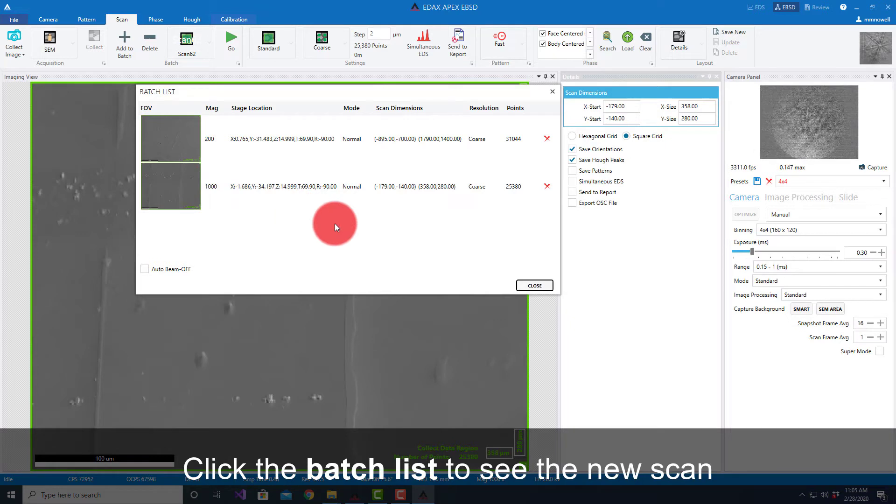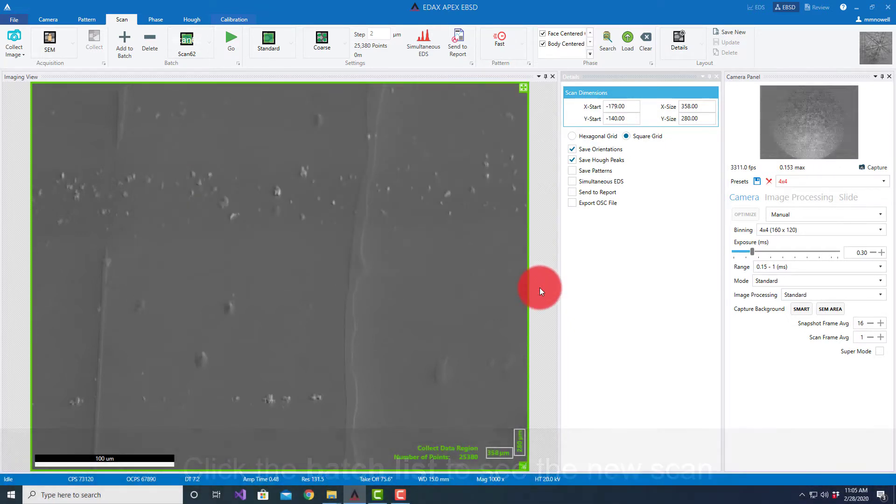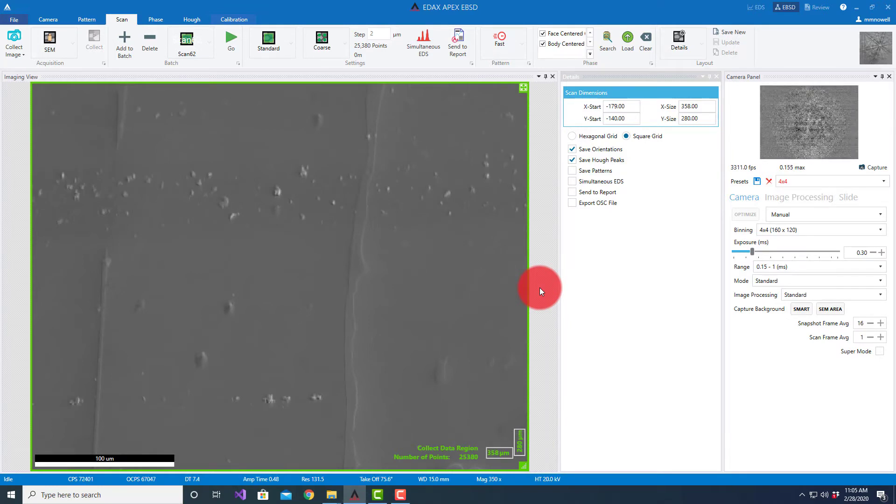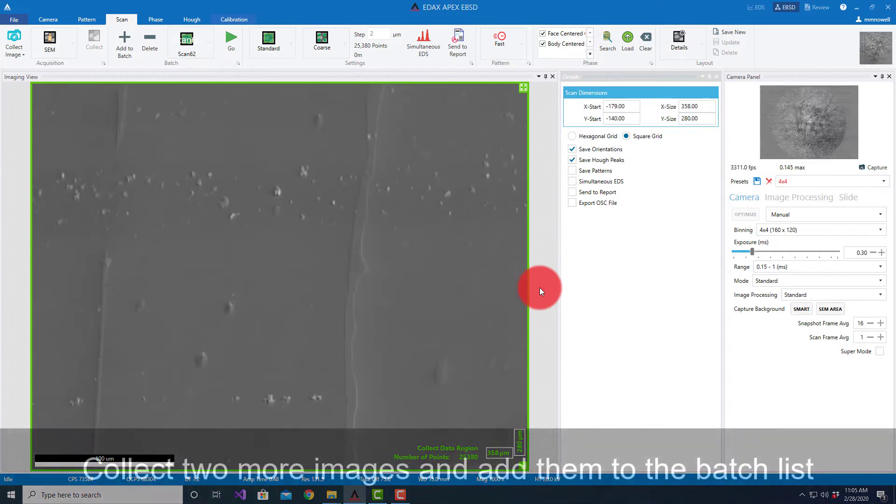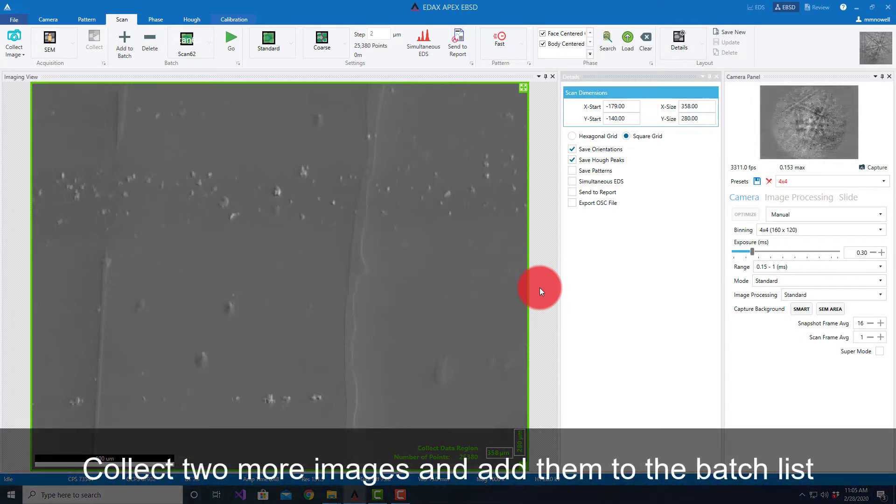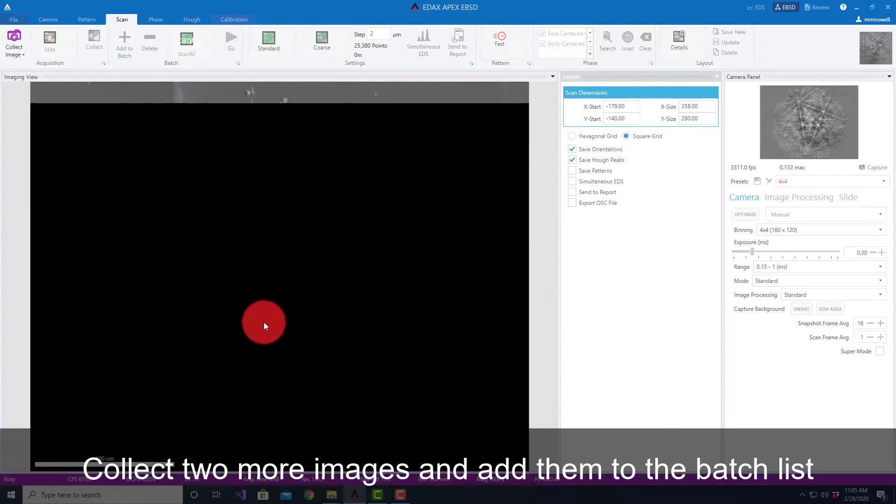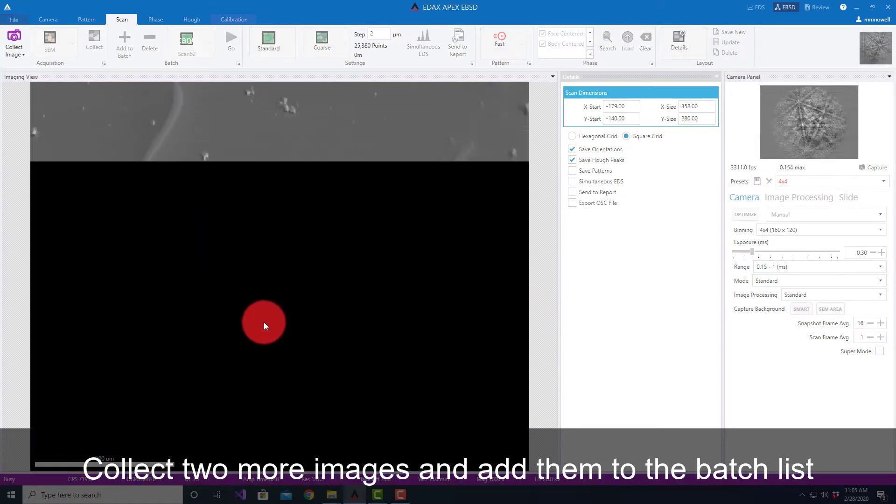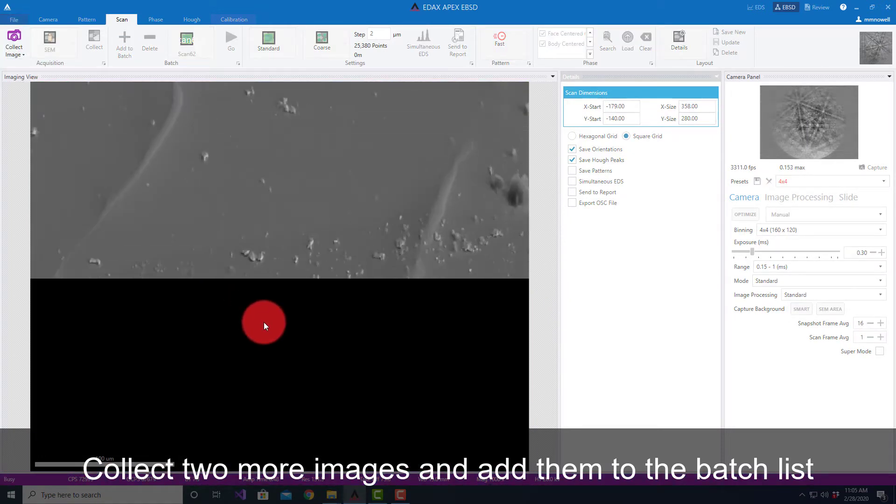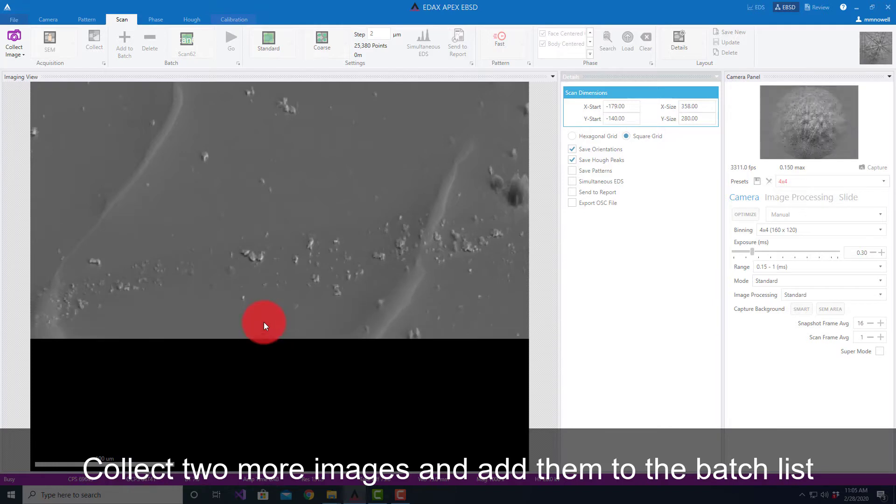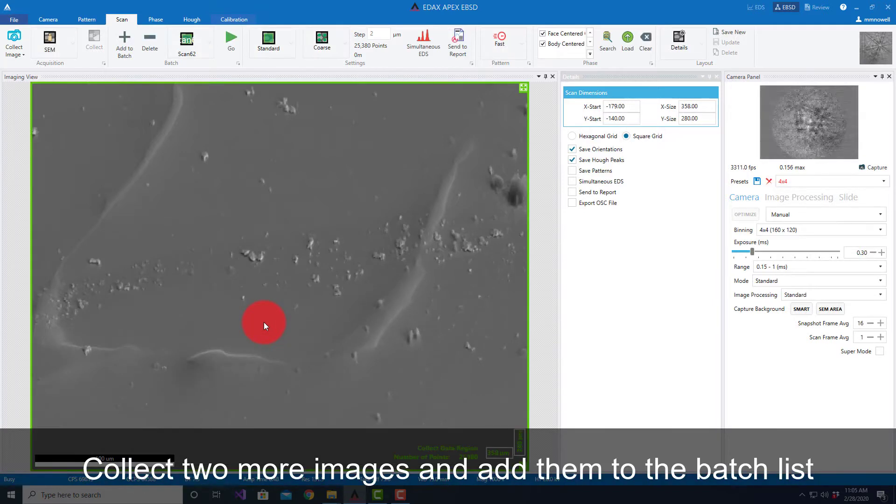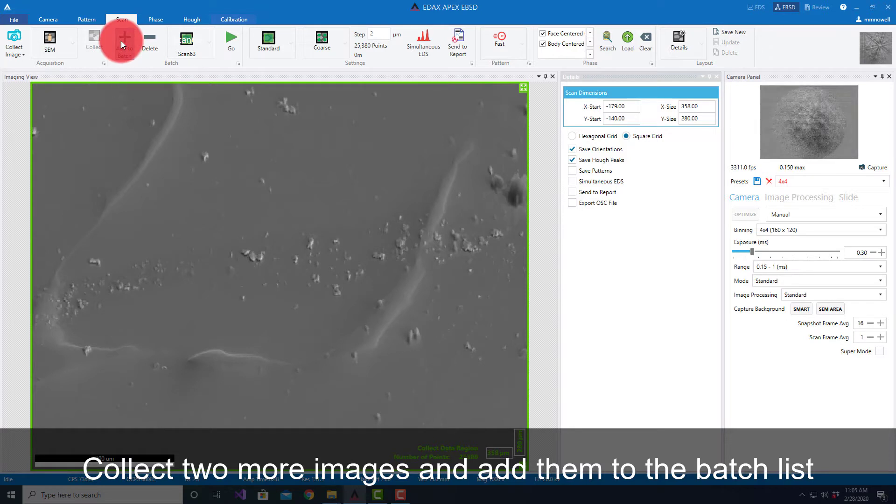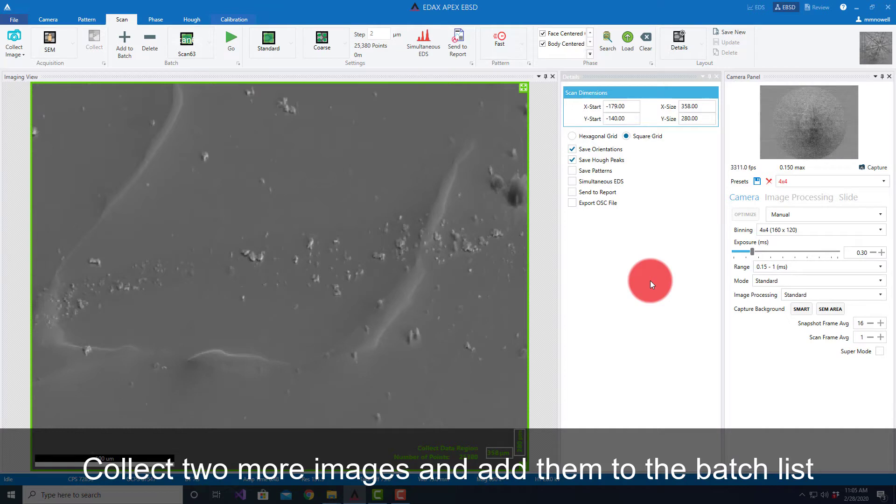And then for fun, I'm going to go to a third location and I'm going to do one at one resolution and say Add to Batch.